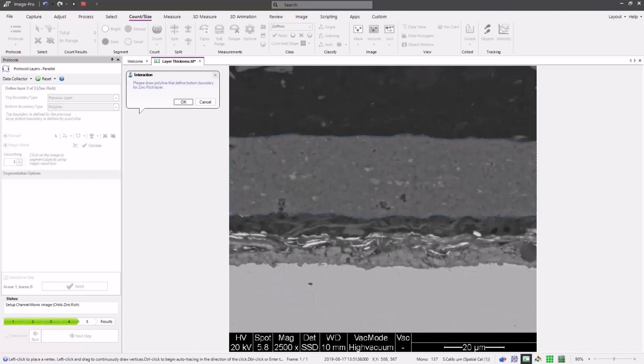And right now, for the demonstration, that tool is already selected, and that is defined by polyline. So I can simply come in and hand draw that polyline. If the boundary was a little more solid, you could use the auto trace and auto trace that line. Here I'm simply going to draw it and come across and double click.